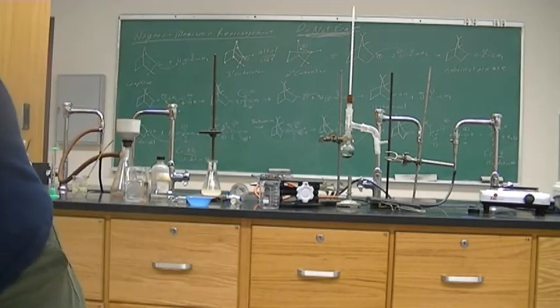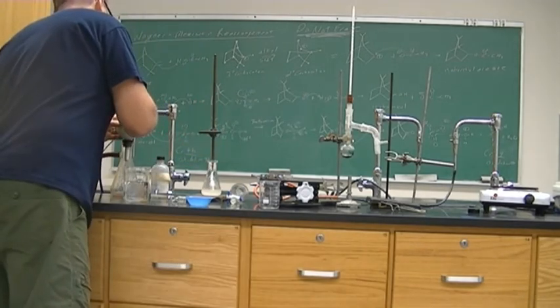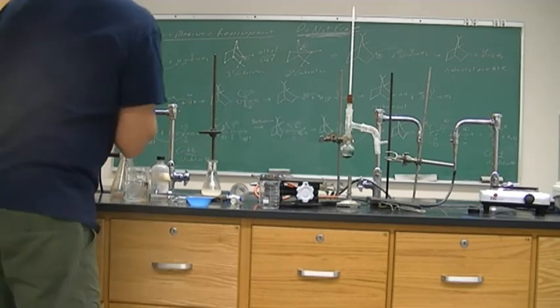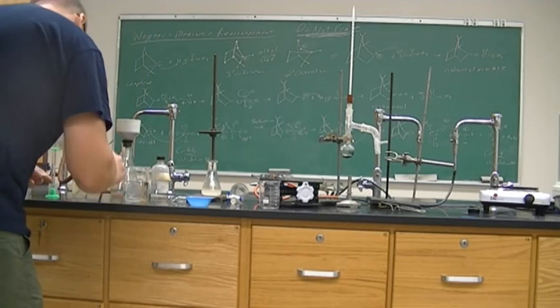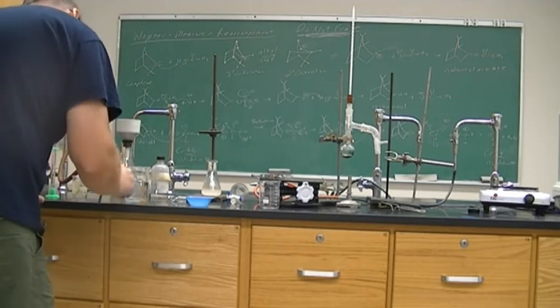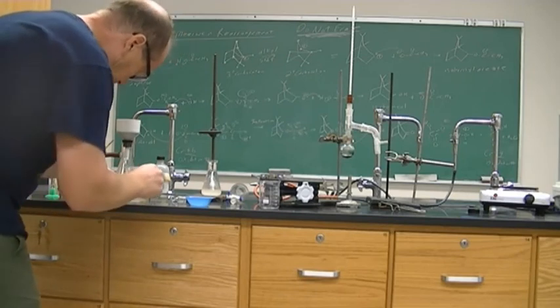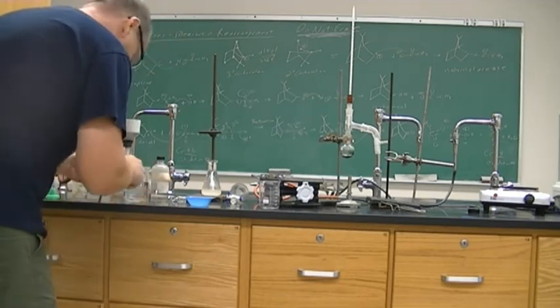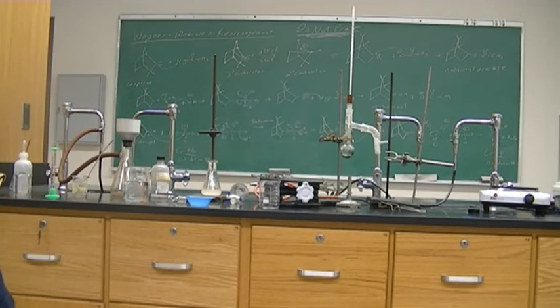Get a melting point. Let's see if I can get some. First reading. Okay. We got some crystals down there. I'm going to do a quick melting point. I hope it's a quick melting point. Let's see.